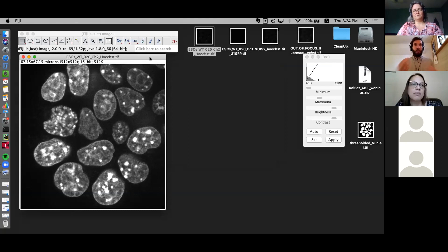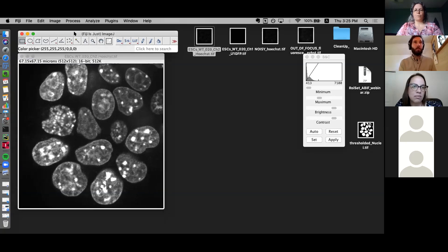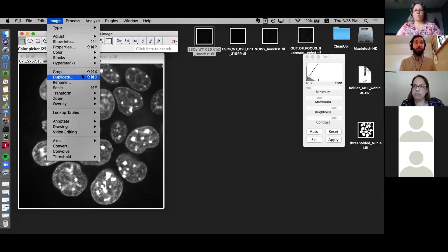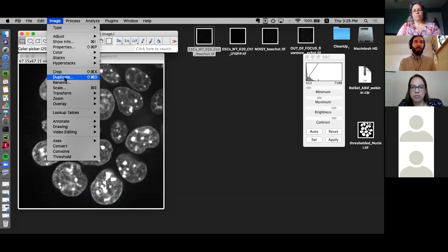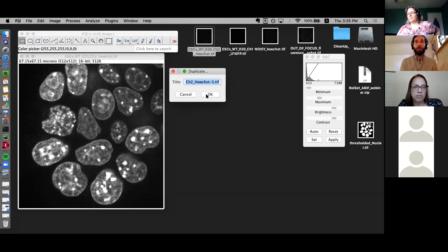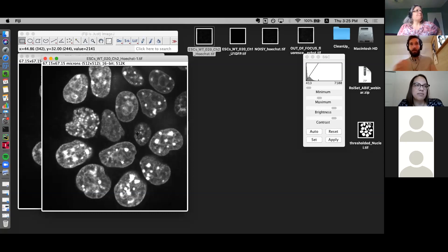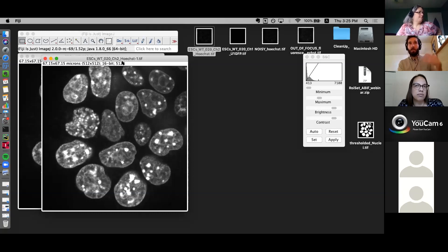Since undo doesn't always work well, it's a good idea to duplicate the image and work on a duplicate. This is the original image. To do that, click on Image and Duplicate. You'll notice there are shortcuts for a lot of these functions that you'll learn over time. It will automatically add a dash-one and iterate that number as we duplicate. If we make a mistake or try a filter that doesn't work, we just close this duplicate, go back to the original, and duplicate again.